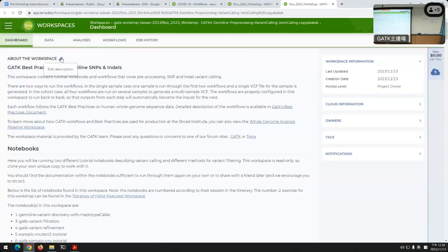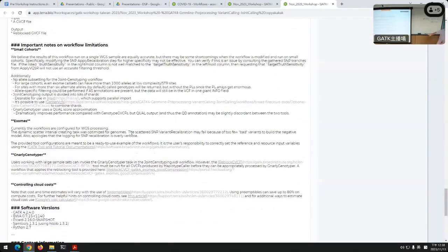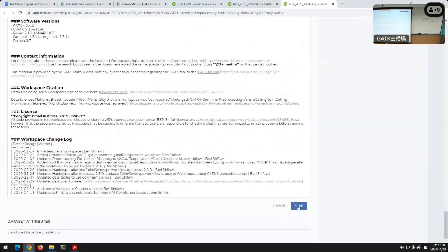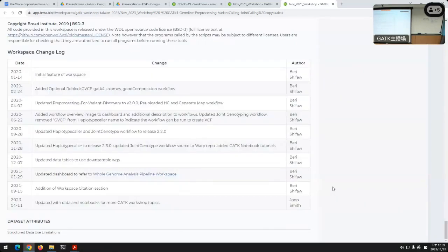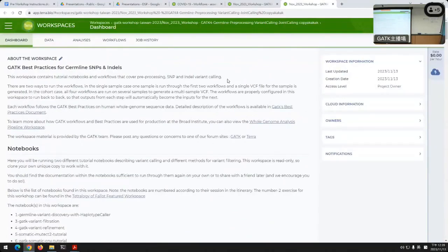And of course, now my big giant dashboard is an editable space. So as I mentioned, it's just one giant markdown field. Out of curiosity, by show of hands, are people familiar with using Markdown? Okay, all right. So Markdown is not as rare. So you'll see lots and lots of Markdown in the Jupyter notebooks. So that's how we edit the dashboard if we wish, and yeah, so you can see these are all the things that changed.